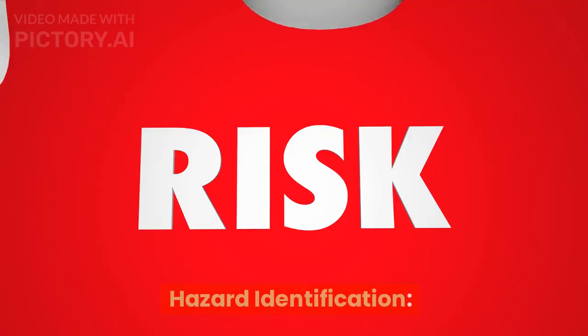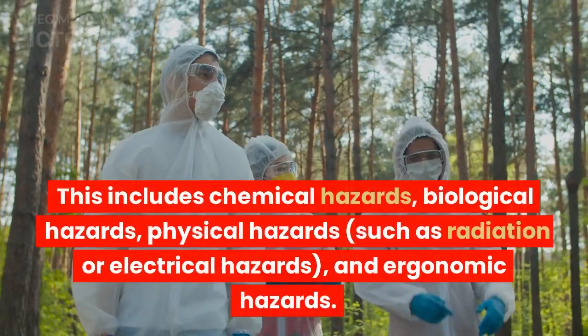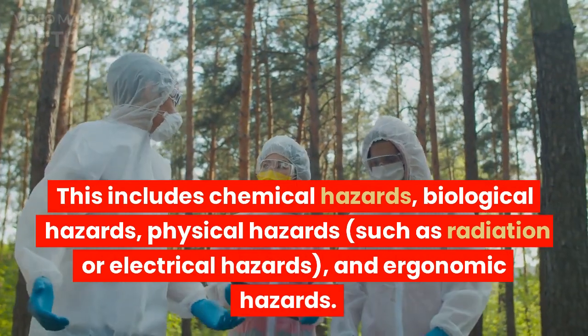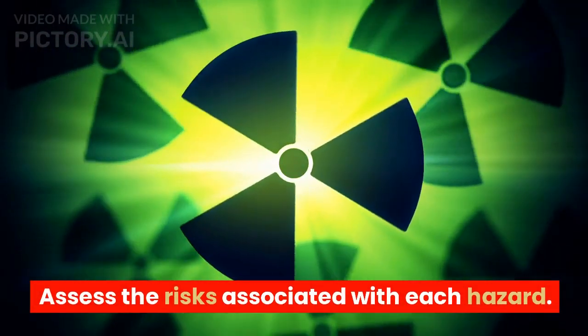1. Hazard identification. Identify potential hazards in the laboratory environment. This includes chemical hazards, biological hazards, physical hazards, such as radiation or electrical hazards, and ergonomic hazards. Assess the risks associated with each hazard.